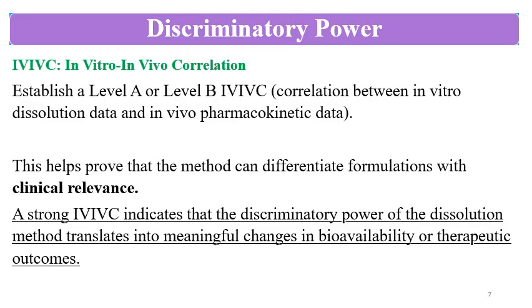Then you can go for IVIVC also. Establish a level A or level B IVIVC correlation between the in vitro dissolution data and the in vivo pharmacokinetic data, and IVIVC will help you to prove that the method can differentiate between the formulations with clinical relevance. So this will help you to justify the dissolution specifications and also the dissolution method's capacity to detect the clinical relevance between the dissolution of some batches.